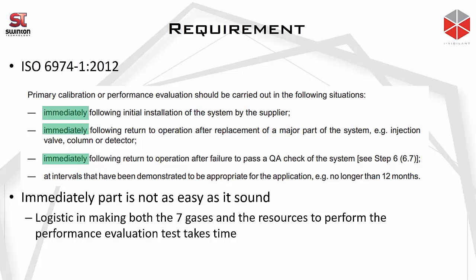The other issue here is that although it is an international standard, not many places in the world can actually perform the ISO 10723 performance evaluation test. To my understanding and knowledge, not many people, let's say in North America, are even aware of what the ISO 10723 standard is all about. And in places like Asia, Southeast Asia, Australia, and Africa, not many people perform it.